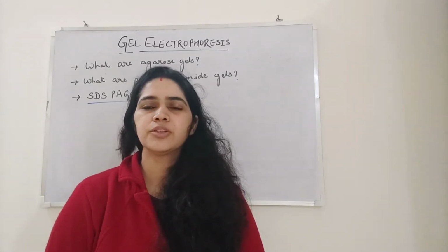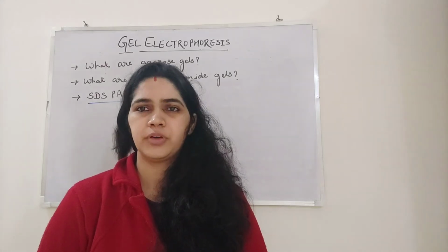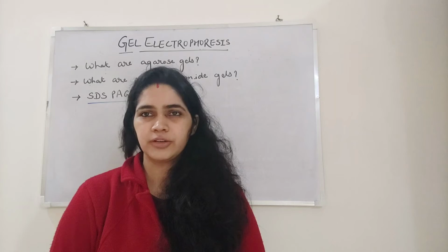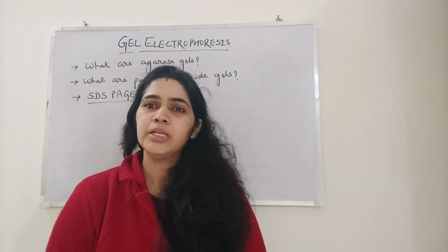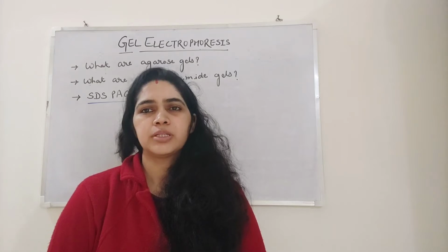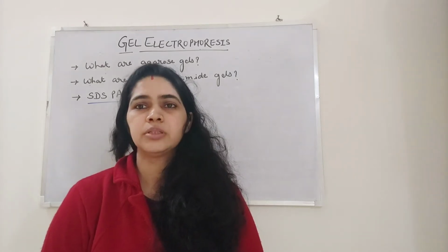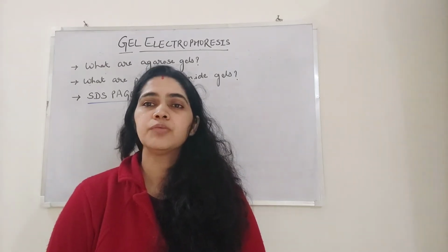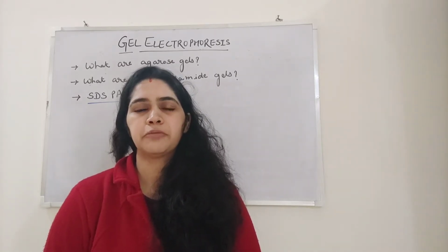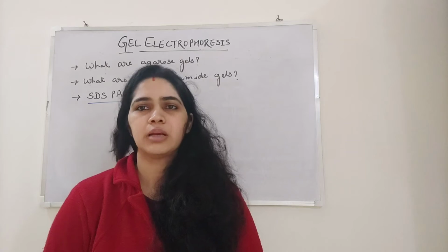Today's video is in continuity with my previous video on gel electrophoresis. ज़्यादातर स्टूडेंट्स में ये कन्फ्यूजन या डाउट रहता है कि क्या जेल इलेक्ट्रोफोरेसिस टेक्निक प्रोटीन्स और आरएनए के लिए भी यूज़ हो सकती है. तो येस, जेल इलेक्ट्रोफोरेसिस कैन बी यूज्ड नॉट ओनली फॉर DNA but also for proteins and nucleic acid. But your supporting medium is different in the cases of proteins and nucleic acid.